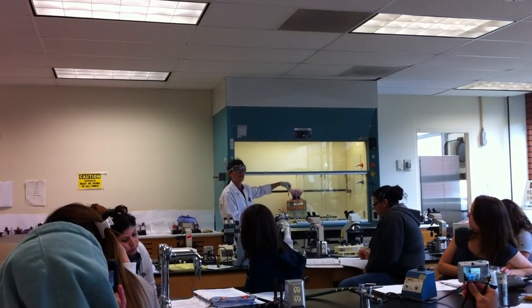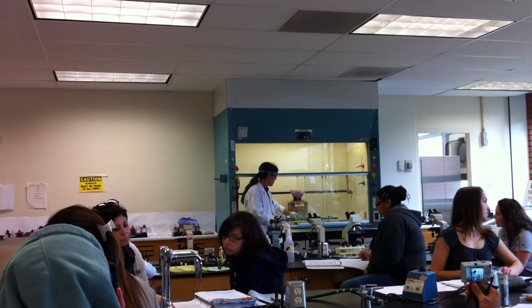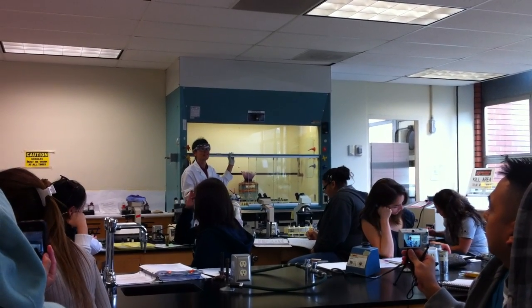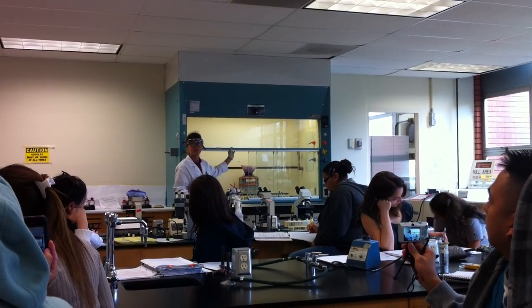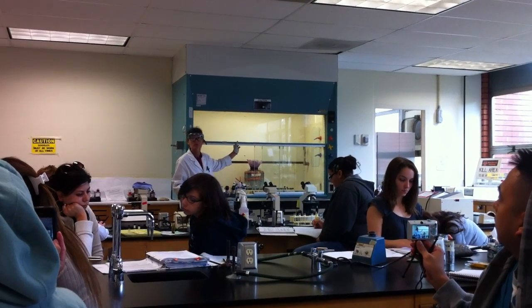Kind of like, so what? Who cares? What does it tell you about your organism if your organism is VP positive? It's usually methyl red negative, and it uses the butylene glycol fermentation pathway. I know this sounds kind of silly. You guys are like, well, of course, but this is how we word it on the lab practical, so I just want you to get used to what answer.